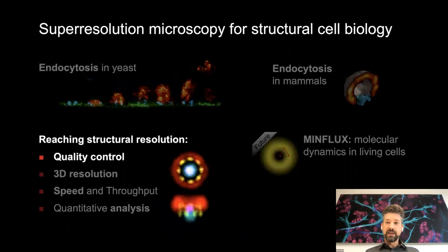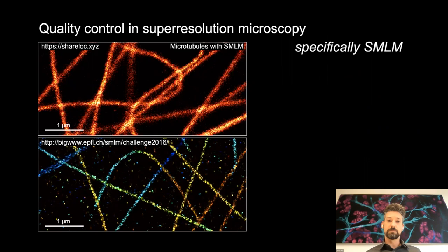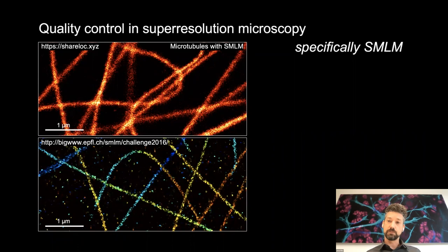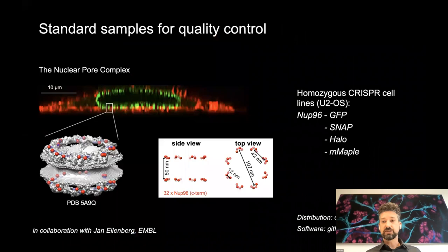Now I would like to change gears and talk about technical developments to push super-resolution microscopy to structural scales. An important but long-neglected topic is quality control, which has not been established for the field of localization microscopy, making it very difficult to decide if our microscopes are as good as they were a year ago or as good as those elsewhere. Here you see two publicly available datasets showing microtubules imaged with basically the same technique, but they don't look exactly the same. The reason can be manifold: the microscope, imaging conditions, labels, sample preparation protocol, or analysis software. What we really need is a sample that is the same every time and everywhere we look at it — a standard sample.